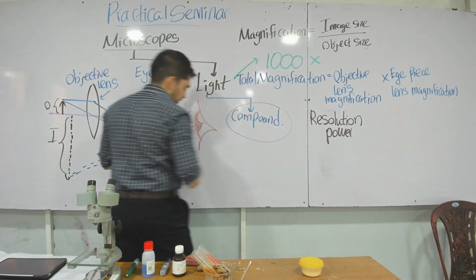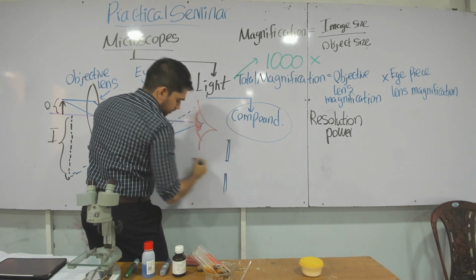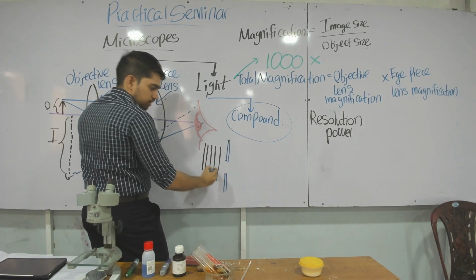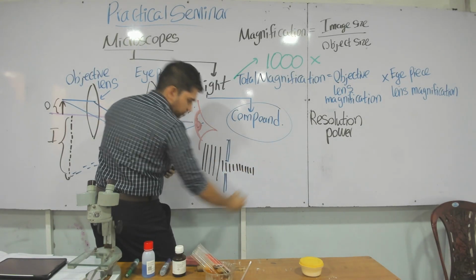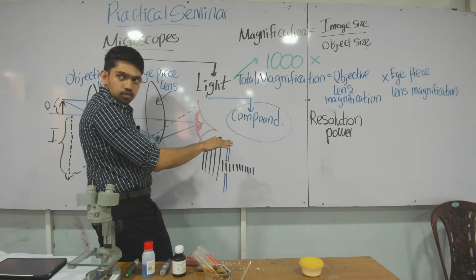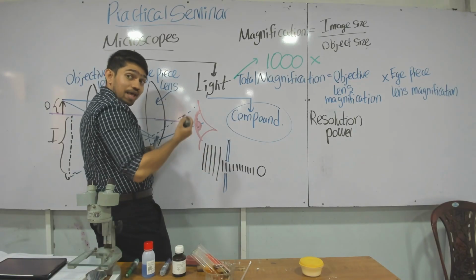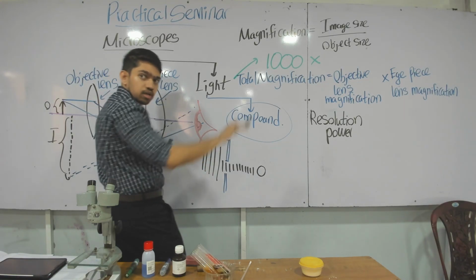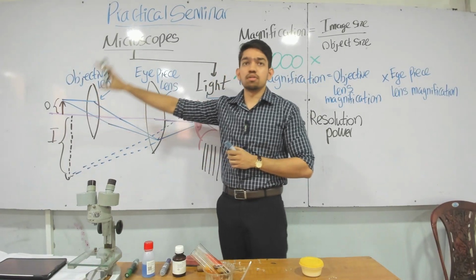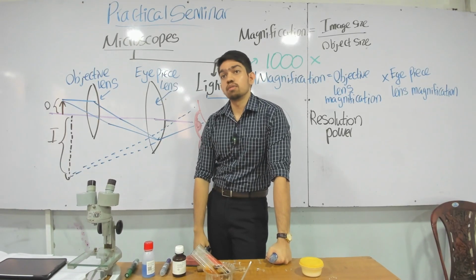This is wave physics. When there's a barrier, if the wavelengths are small, light waves coming like this are stopped by the barrier on the two sides, and the waves go through the gaps. So the sharpness, the clarity of the image, depends on the wavelength of the waves that are hitting the barrier. So with light magnification, at a certain point, the wavelength of light is going to make the image blurred.